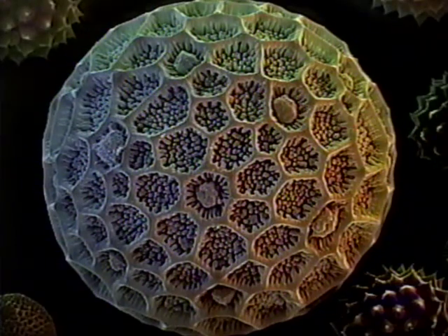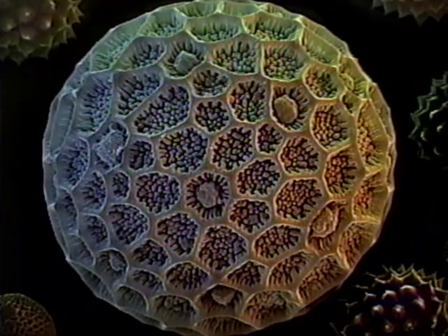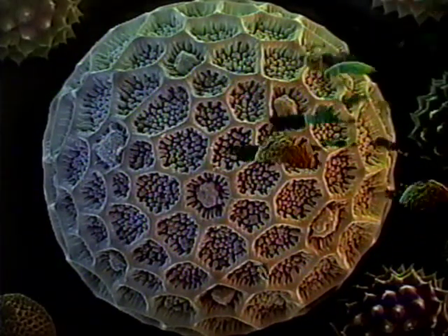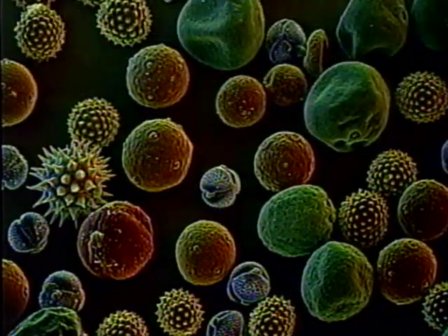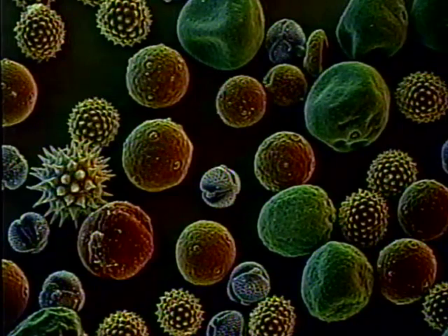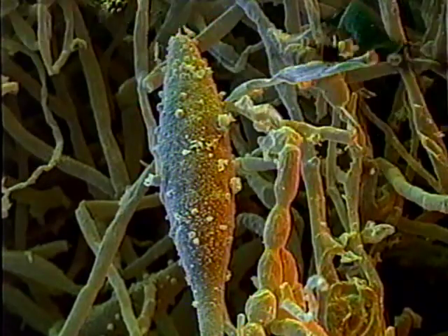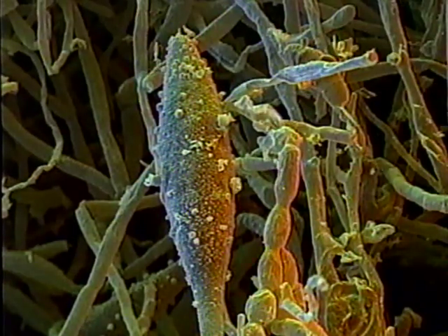And I know we're looking at some really fine pictures on the screen right now. And Judy, you might mention, some of this looks like graphic artwork. Now, what are some of these things? Well, this is a pollen that's taken by an internationally famous photographer, actually, who bought a scanning microscope and got into the photography of scanning microscopy. And he's put on 3 different detectors and pseudo-colored many of these to really make art objects out of scanning microscopy. These are all different types of pollen, and you can classify pollen by looking at the surface of it.